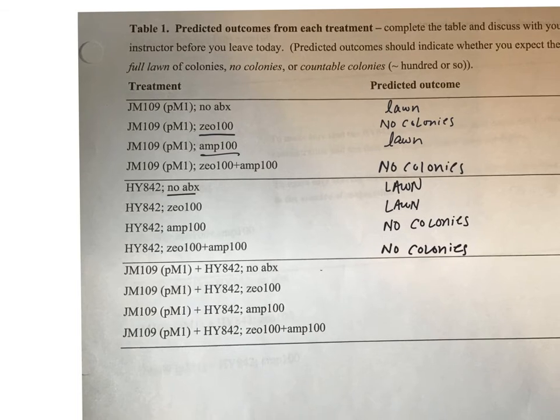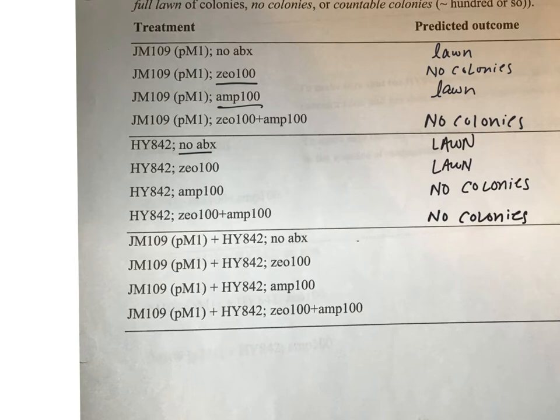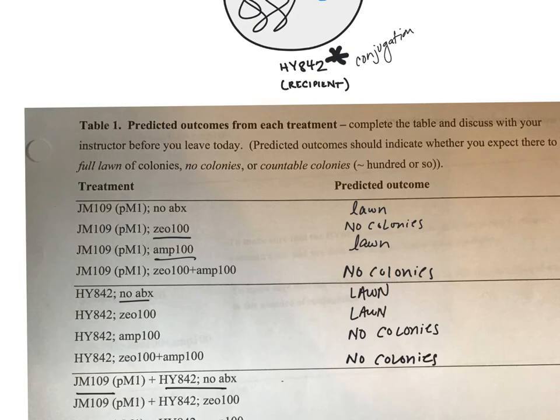All right, so now the question is, what do we get when we do a mixture of these two bacteria? So I think the important thing to keep in mind here, with regards to this third experiment, is that you've taken a subpopulation of the JM109 and a population of the HY842, mixed them together, and then poured that on a plate. So when you've poured that on the plate, you have some JM109, you have some HY842, and you've got those that actually underwent conjugation, the HY842 conjugates. So we've got a population of all three bacteria on that final plate.